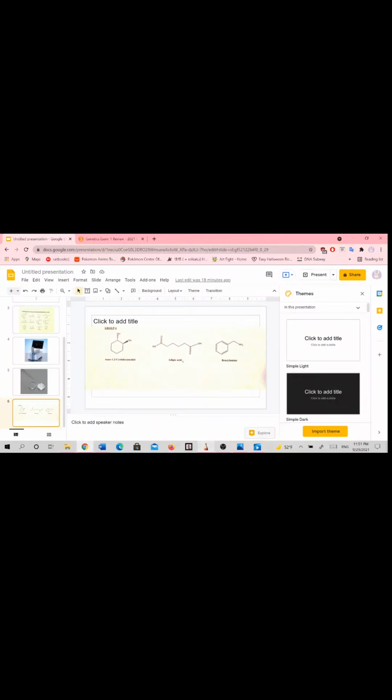Furthermore, you do have all of the carbon-hydrogen sp2 and sp3 hybridization, and you do not see any oxygen-hydrogen listed, let alone a carbon double bonded to oxygen for an ester or a ketone or carboxylic acid. You don't see any of those points. So you can pretty much safely assume that of these three compounds, the IR spectroscopy graph lets us know that it is the benzylamine.